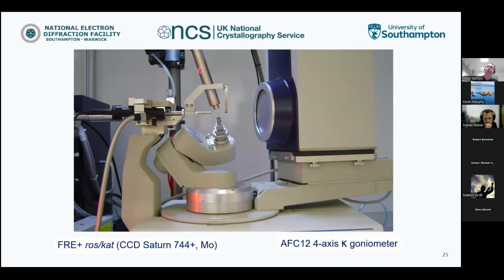Generally, we cool our crystals down. The standard measurement is 100K, at 100 Kelvin. This means that we've cooled the vibrations, so we've got less thermal vibration going on. Generally, we freeze the crystal, and if there's damage by the X-rays, normally at 100K, most often this will not occur, not always. So we have our crystal on the loop, and then we can move the crystal.